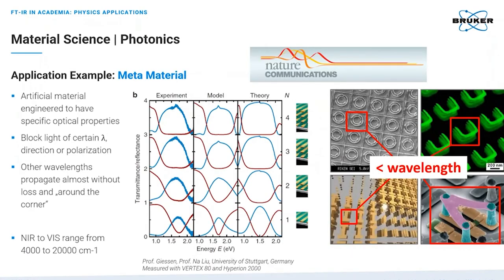Well, the next example is about metamaterial, which has been a very hot research topic under photonics since decades and is still attracting much interest and investigations. Metamaterials are artificial materials engineered to have properties that may not be found in nature. They are assemblies of multiple individual elements fashioned from conventional microscopic materials such as metals or plastics, but usually arranged in pre-designed periodic patterns. Many scientists in different fields have donated a lot of effort to tailor the novel properties of metamaterials, in particular the optical ones.